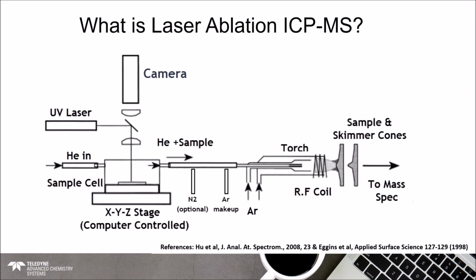You'll see that line coming out of it hits another line there and bounces off to put the light down into the sample chamber. That one bounce is, in this case, indicative of the full light path, which I'll show on the next slide. But the idea essentially is that we take that beam of light, it goes through a number of optics, and then goes down into the sample chamber to strike the sample.